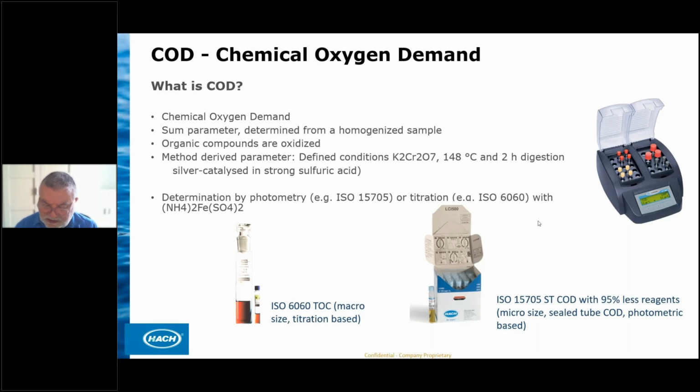COD in cuvette test was also standardized in 2002 under the name STCOD. It is ISO 15705. And this method, this LCK or cuvette test method, has quickly supplanted the historical method as its benefits are numerous.